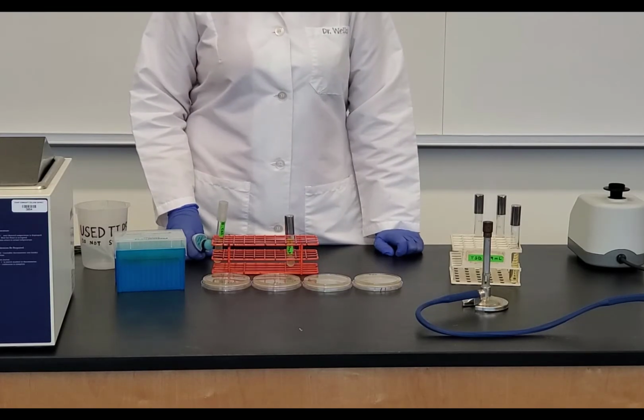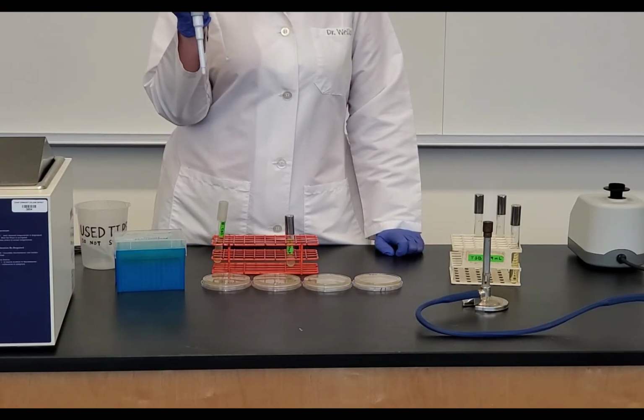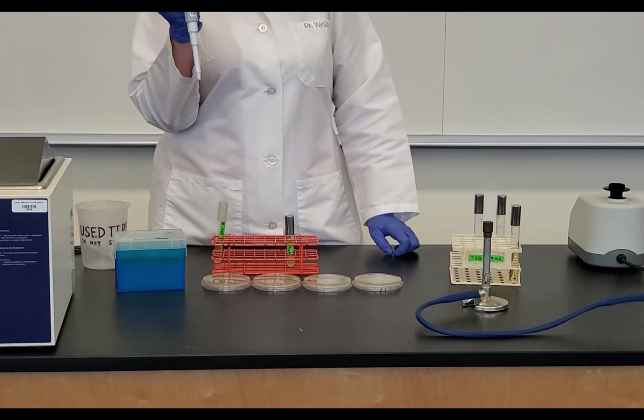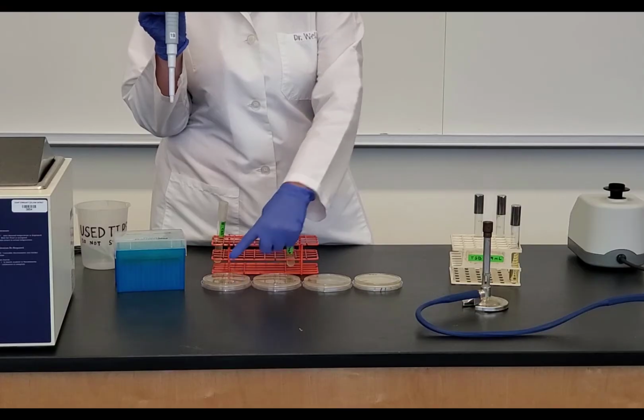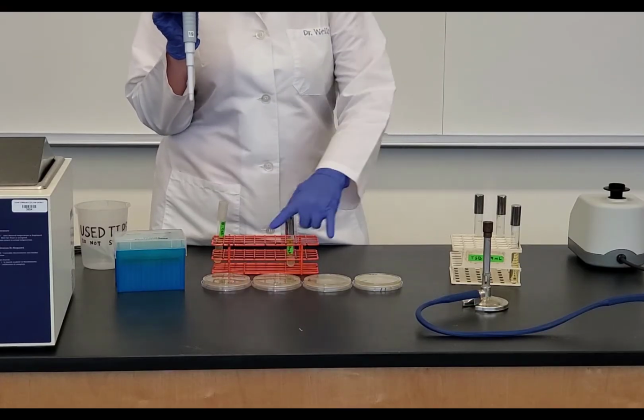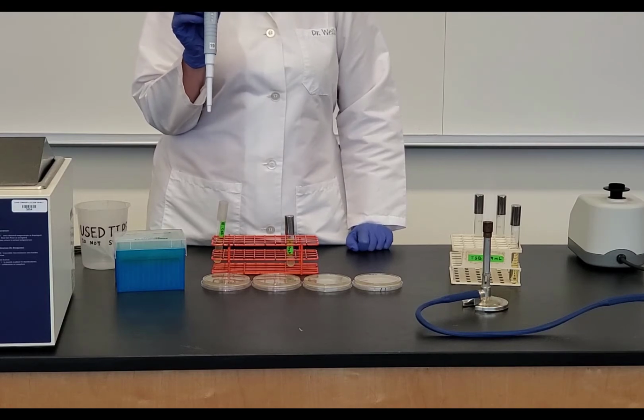Remember that my 0.1 milliliters is going to correspond to my 100 microliters. Since I already have my pipette set to 100 microliters, I'm going to do my 10 to the negative 5 and my 10 to the negative 7 plate first, because those are the ones that are going to require the micropipetter to be set at 100.